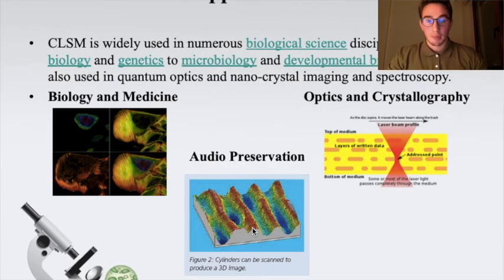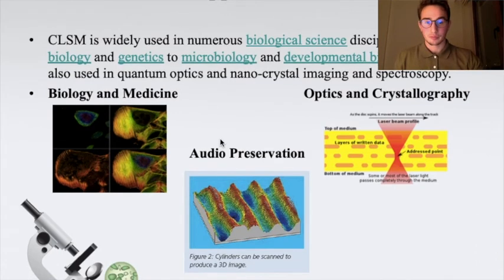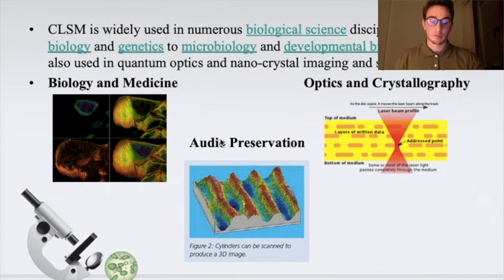Let's move on to the applications and usage areas. Actually, it's used in biological sciences, and quantum optics, and nanocrystal imaging and spectroscopy.